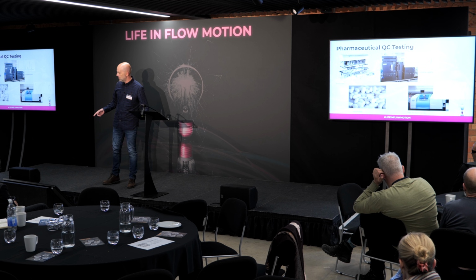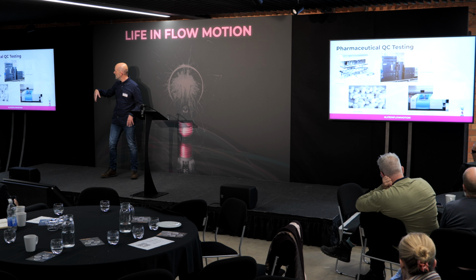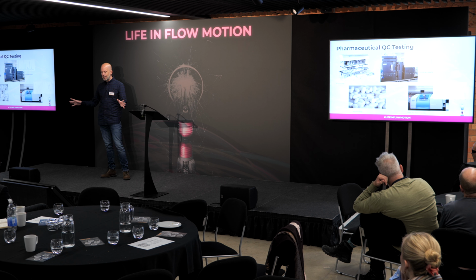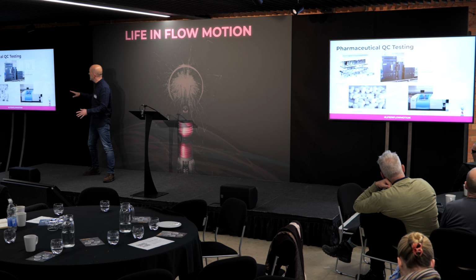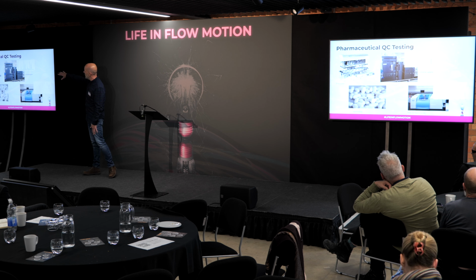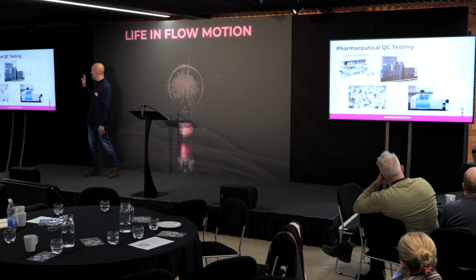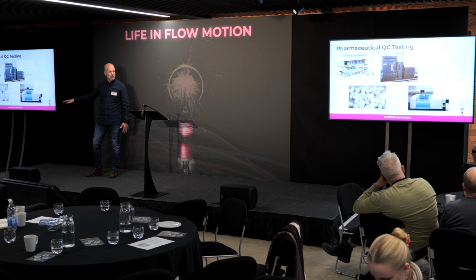We've got, on the top left, that's dissolution testing. So that's, you put a tablet into a media, 6 tablets, 6 different pots, and then you take samples to make sure the tablet disperses. And then you may take those samples and then put them on, do some chromatography. That tells you the concentration of whatever's in there. You also take some samples, do some more analysis, and tell you if any impurities are in there.